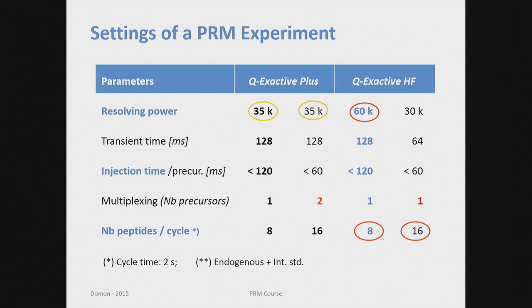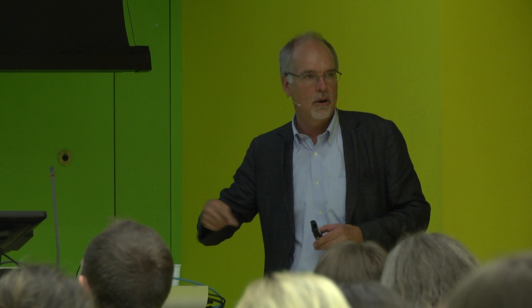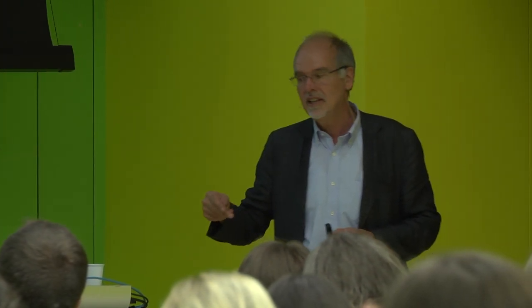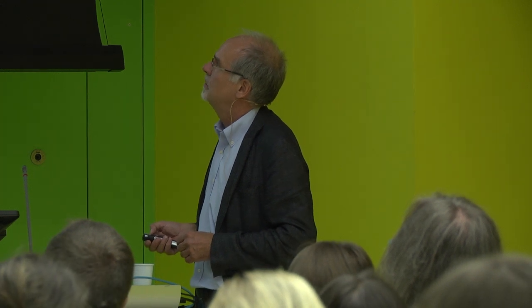And this is, if you schedule your measurements you do in SRM, every window you can use the same kind of parameters. And I will discuss that in a little more detail after lunch. And I will show you how we can do that a little or significantly more efficiently, not just by applying a default method, but by doing it on the fly, where the system can recalculate depending on the parameters and optimize. So we have optimized sensitivity and selectivity.